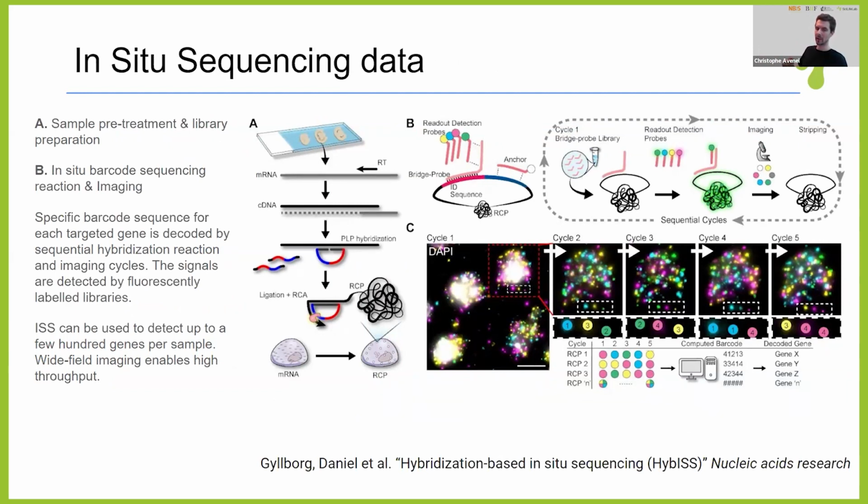So basically, you get the targeted analysis of RNA genes directly on the tissue with spatial coordinates and with subcellular resolution.